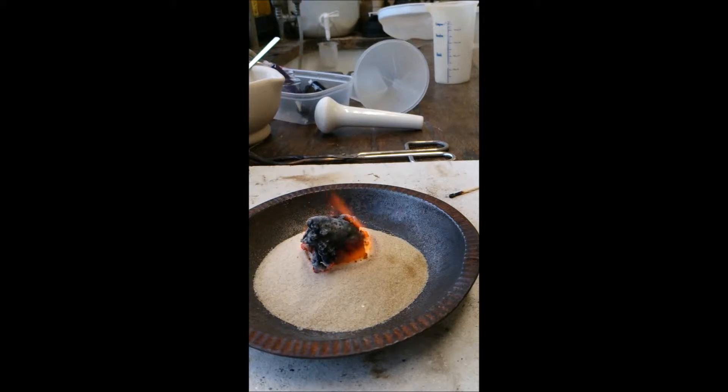So here we go, it's starting to form quite nicely now. You see the carbonate causing the CO2 to bubble up through the burning sugar, which is producing these really quite peculiar lumps of sugar basically burning.